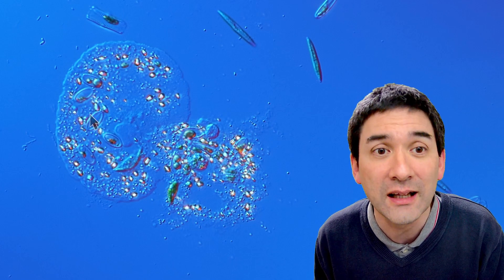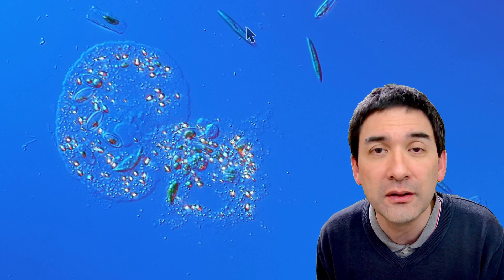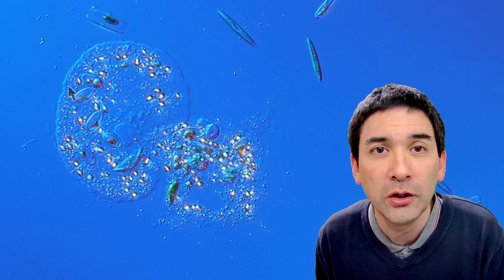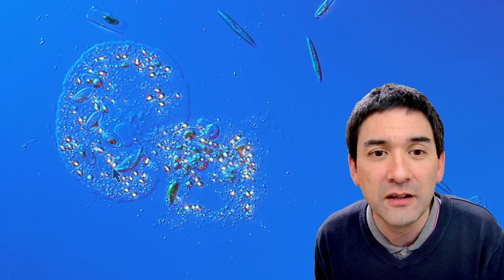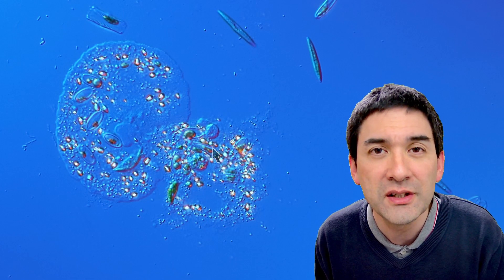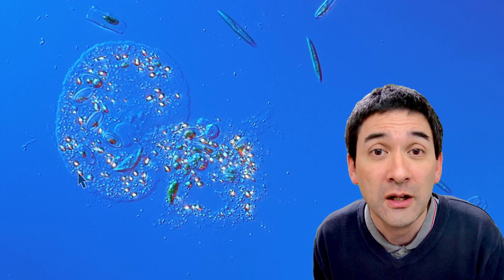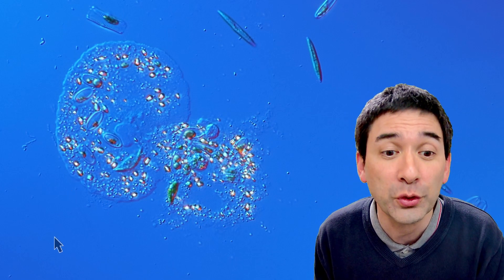Diatoms are algae and you see also some diatoms outside here in the surrounding medium, but the smaller ones, several smaller ones, the amoeba has devoured and eaten. And you notice that these are indeed algae because of their green color because the chloroplasts are doing photosynthesis.